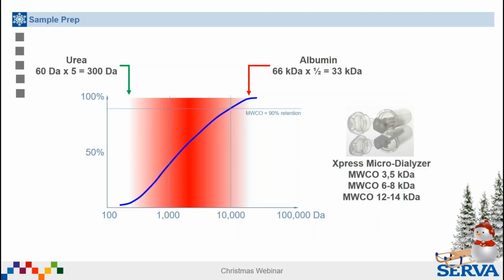If you want to get rid of some residues, then the best thing is to dialyze your sample. Many customers of us do not know exactly how to choose the right dialysis system. So there are two rules of thumb where you can easily calculate yourself the range in between which the right molecular weight cutoff can be chosen.